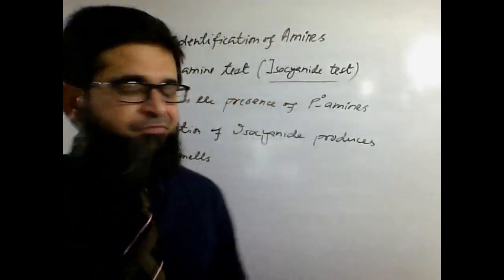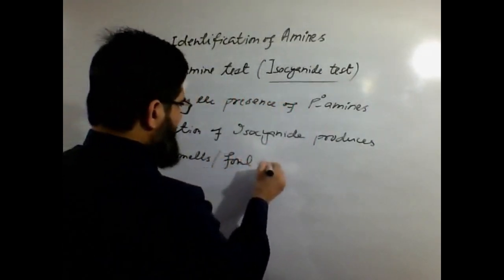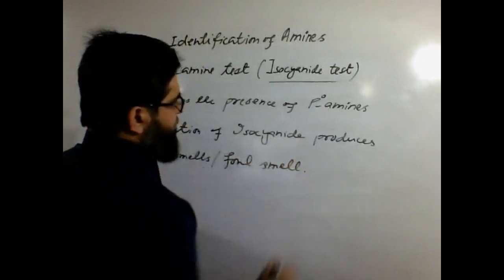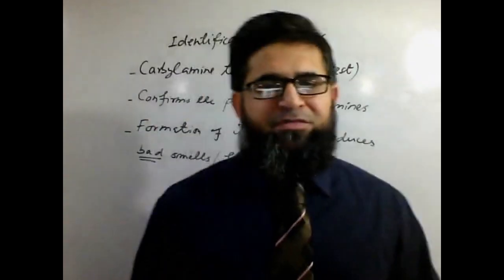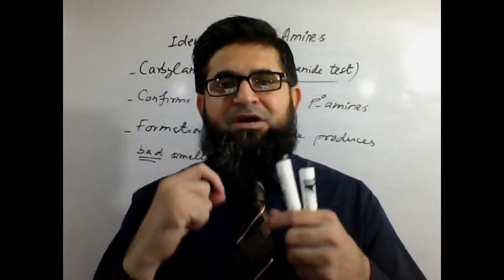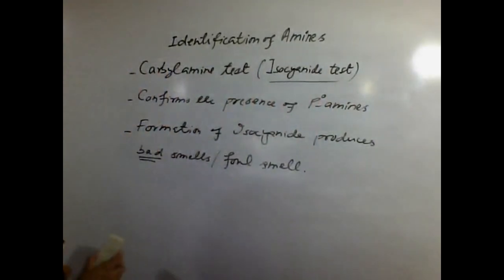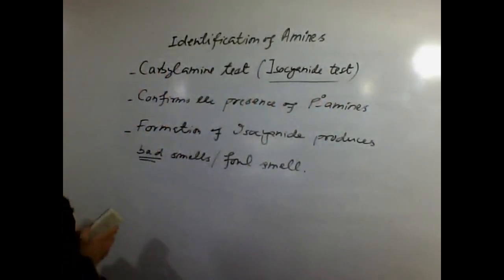So the evolution of such smells from the test tube will give you a clue that your compound is a primary amine. This is how this test helps you confirm the presence of primary amines.